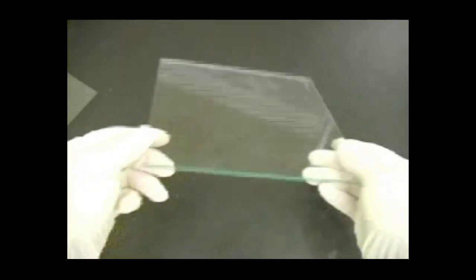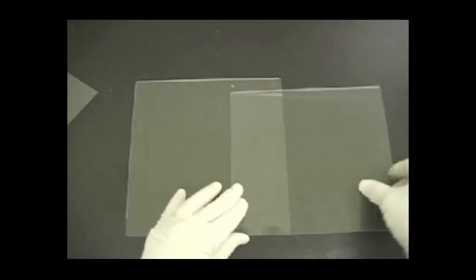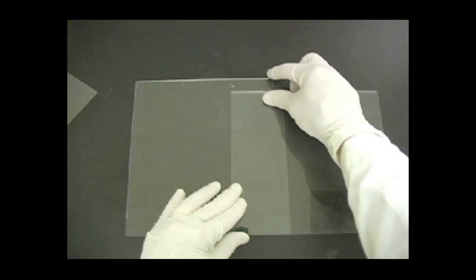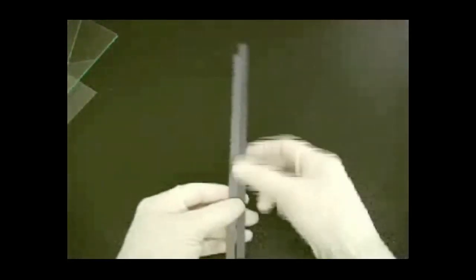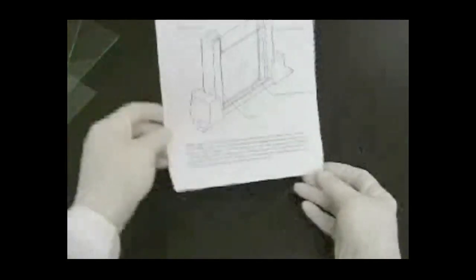You'll need 20 centimeter by 22.3 centimeter tall glass plates, 20 centimeter by 20 centimeter short glass plates, narrow spacers, and Protein II XL alignment cards.